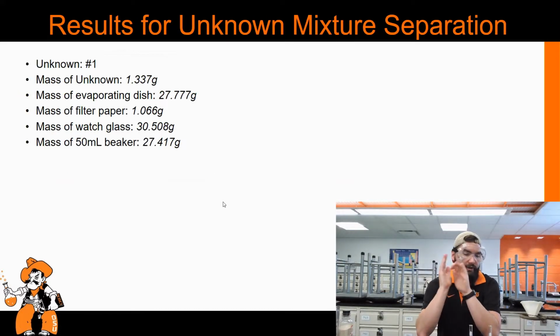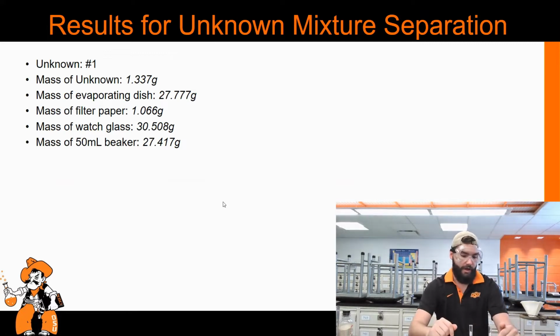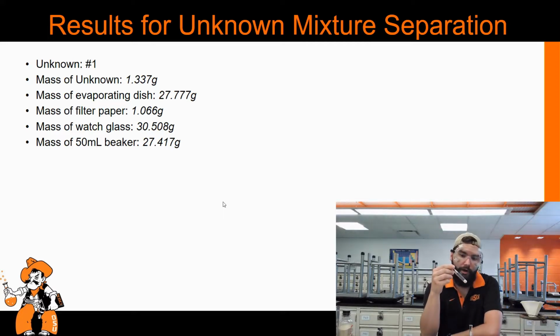All right, so I've gone ahead and I've set everything up. I selected unknown number 1 for today. I weighed out 1.337 grams of my unknown and put it into this test tube.